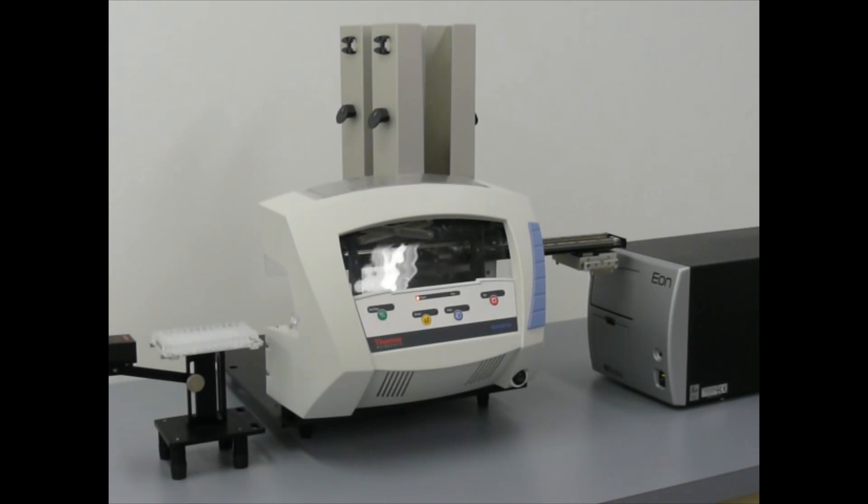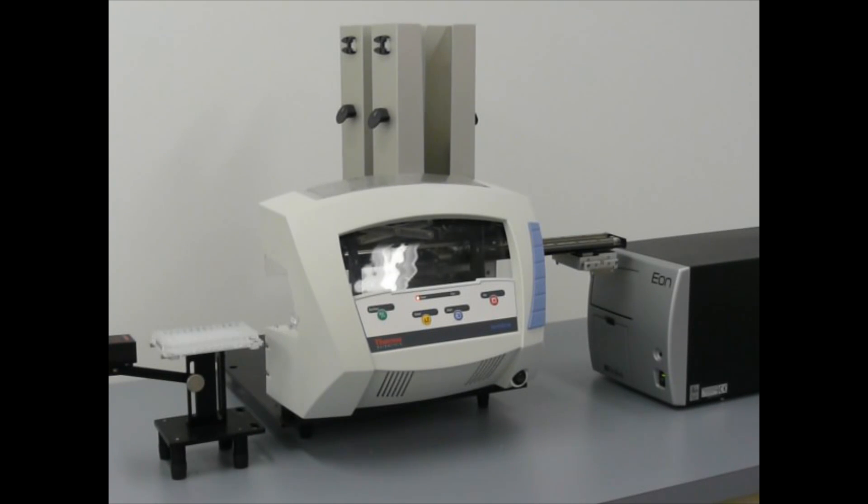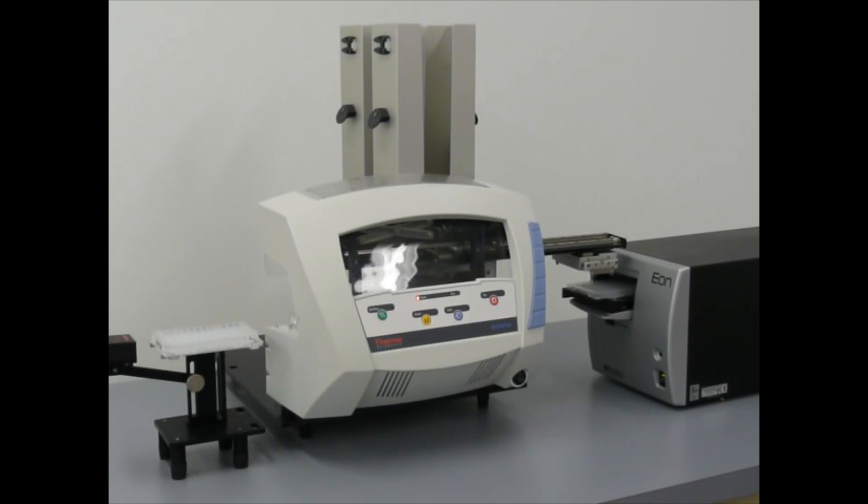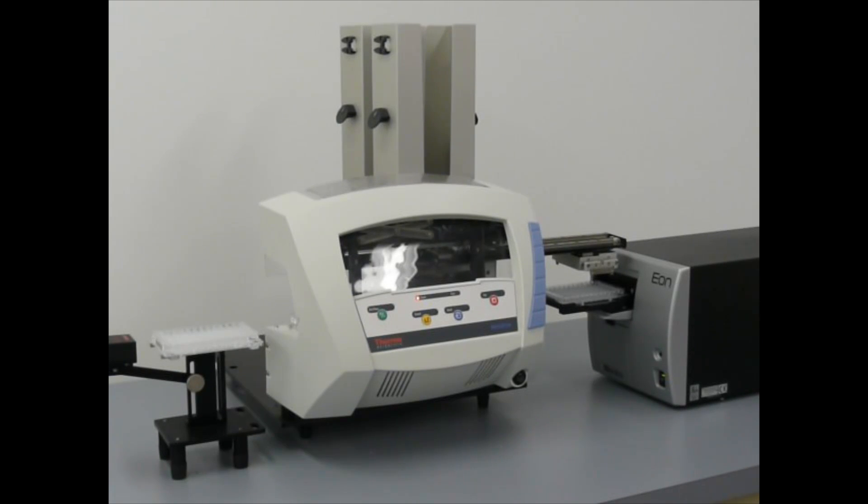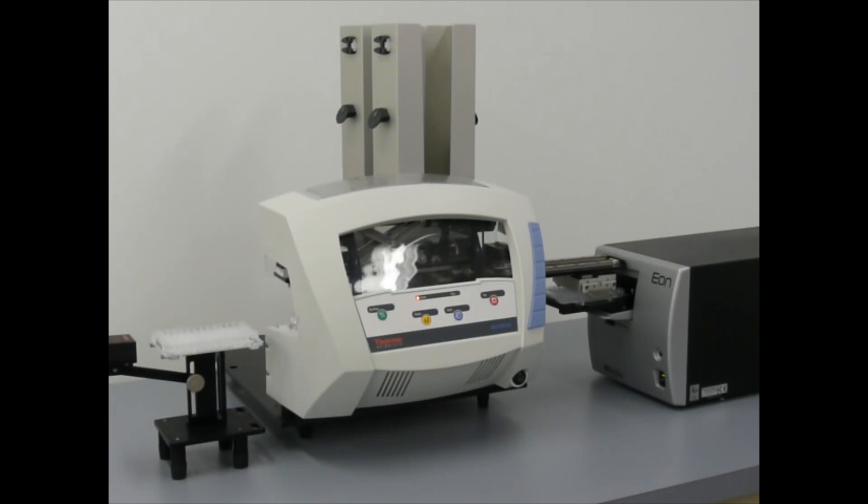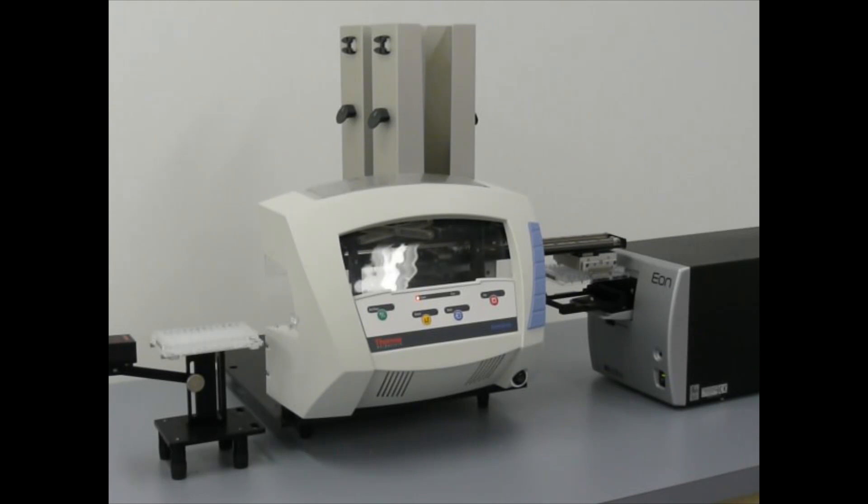You'll notice how the RapidStack queues up plates using a staging nest and smoothly orchestrates movements to maximize uptime of the Eon. Let's watch a little more, and then we'll move on to the software setup.